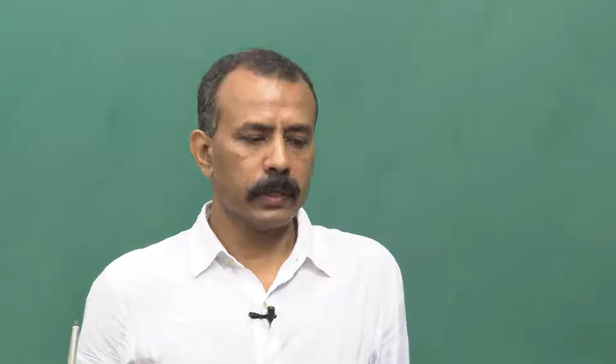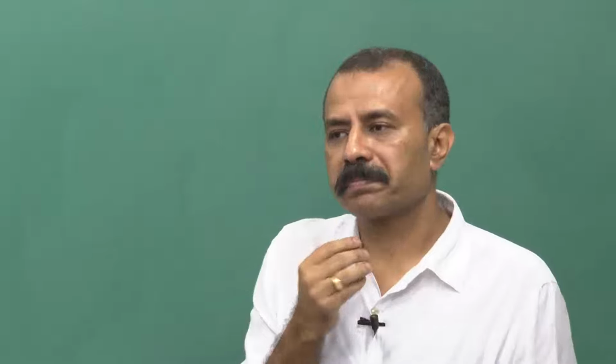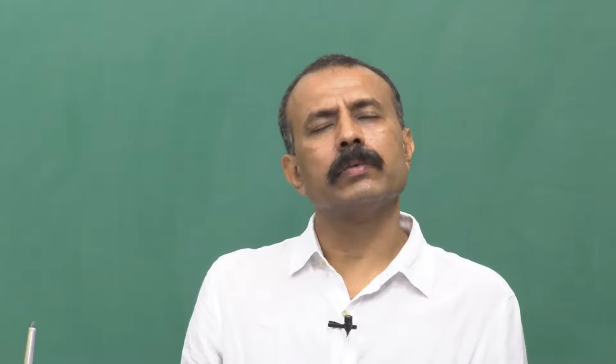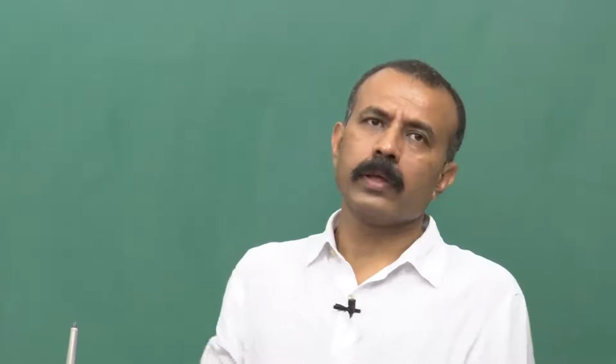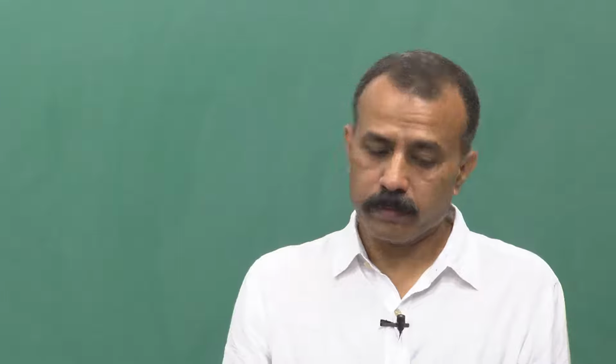To the lecture series in cell culture. So, for the last two classes we have been talking about how we can measure, using a micro cantilever system, the force generated by the myotubes. In the last class we talked about that if the cantilever bends and you have a way to measure the change in the angle of the cantilever, then you can do so. In order to do that, there are certain setups currently being used.